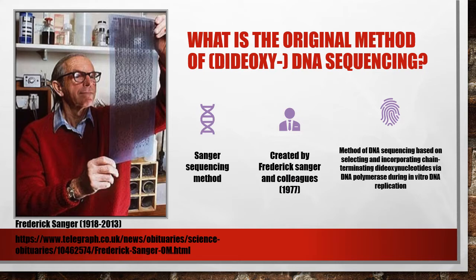So, what is dideoxy DNA sequencing? Well, let's start with the basics. First, dideoxy DNA sequencing was created by Frederick Sanger and his colleagues in 1977. This particular method of sequencing will later be known as the Sanger sequencing method.